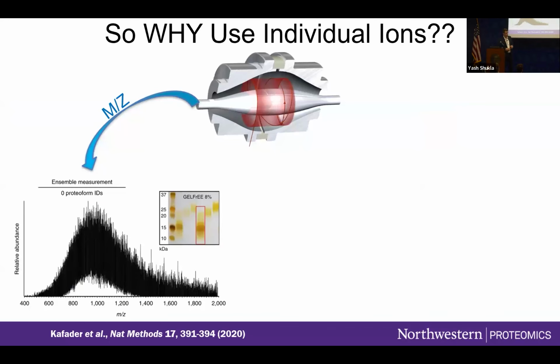So you might be thinking, why is this important? If we have a complex sample, such as keratinocyte lysate, we don't do any separations with it. We do gel-free fractionation, though. We take the 0 to 25 kilodalton fraction, shoot it into the mass spectrometer. We expect there to be thousands of proteoforms. On top of this, we get splitting of charge states over the m/z domain, and we get a really, really complex spectrum. It's so complex, we actually do not see any peaks.